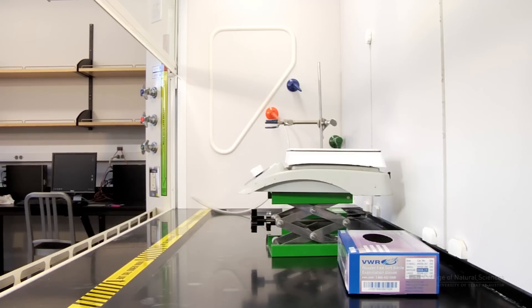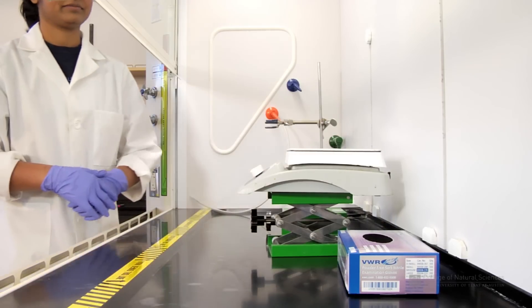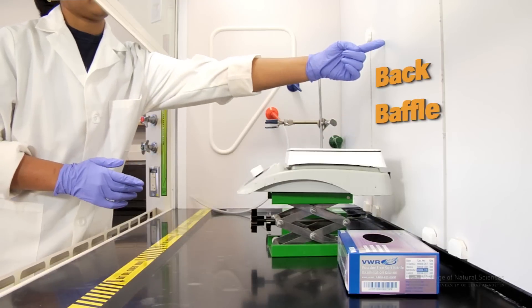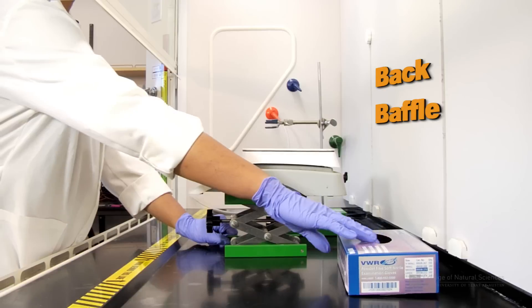There are important guidelines to follow in order to use a fume hood safely. First of all, the back baffle of the hood should not be obstructed. The back of the fume hood is where air flows through.